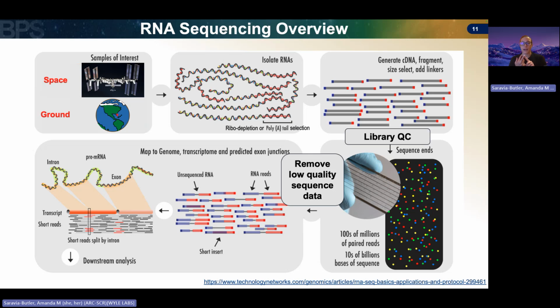As a reminder, primer dimers are when two adapters come together to form a dimer without having a target sequence in the middle. These are very dangerous because the flow cell has a bias towards short sequences. And so these primer dimers are going to be more likely to latch onto your flow cell and get sequenced over your longer libraries that have your target region of interest.